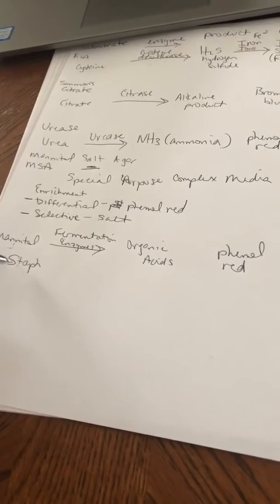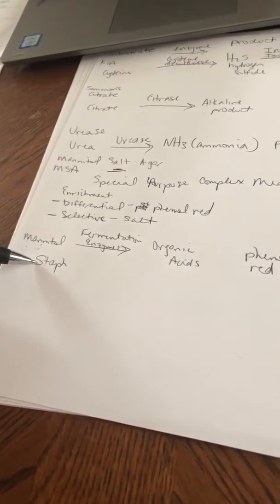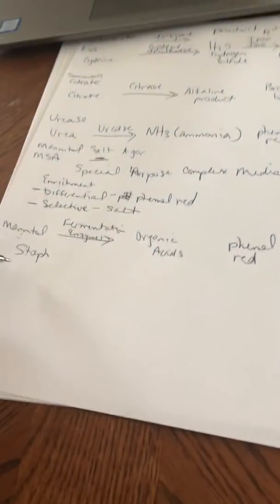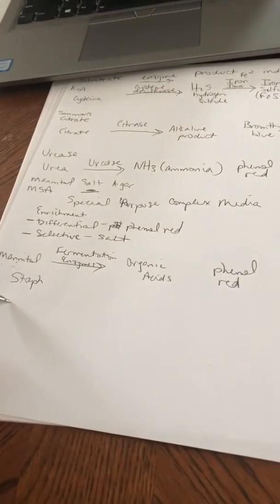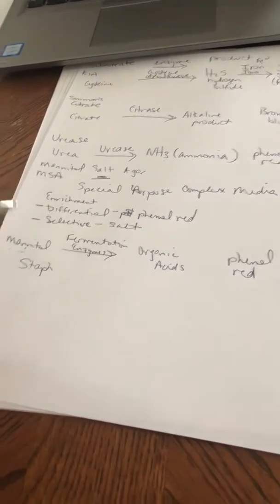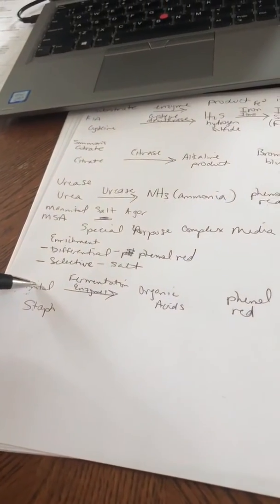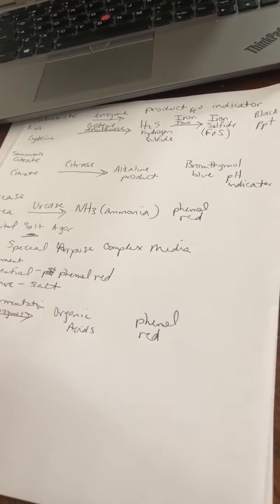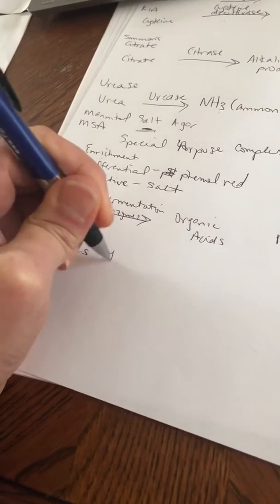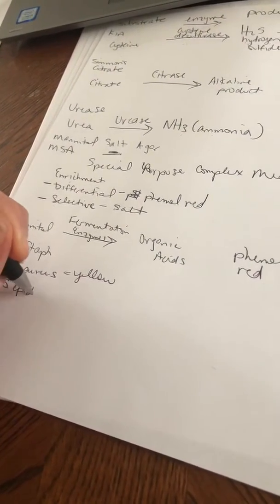And then once we know that staph species can grow, if you're trying to determine whether you have staph epidermidis, which is a normal flora for everybody, or staph aureus, which can be a normal flora for some people and is also implicated in infection usually, you can do a swab of this mannitol salt agar, and if it turns yellow, you know that staph aureus is present. And if it turns magenta, you know that staph epidermidis is present.